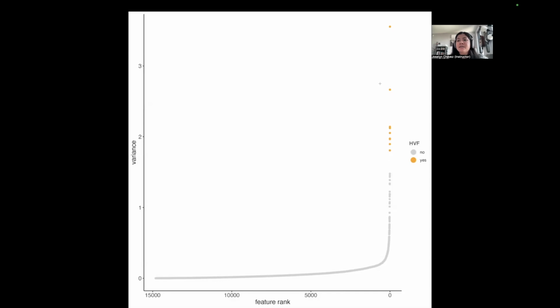You need to consider the sample source, because depending on the tissue, you could get a different number of genes per cell or per spot. There are other tissues that are more difficult to handle. So the purpose of this workshop is showing what we can do with the Giotto package, but of course, choosing the best arguments to use and the best values for those arguments depends a lot on each case.